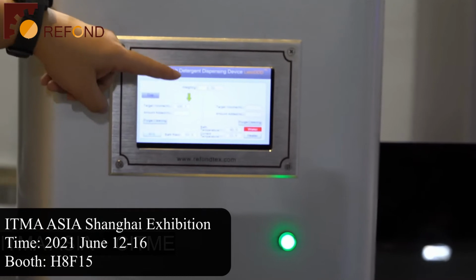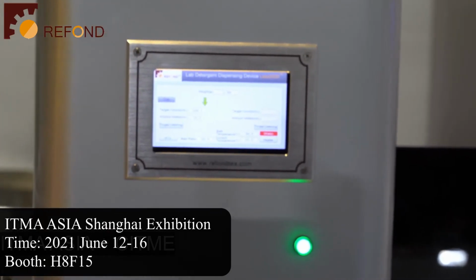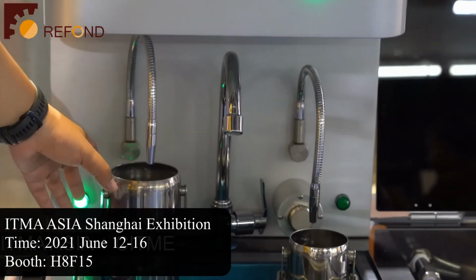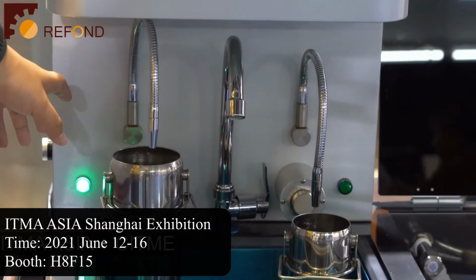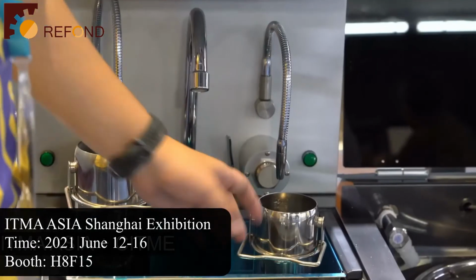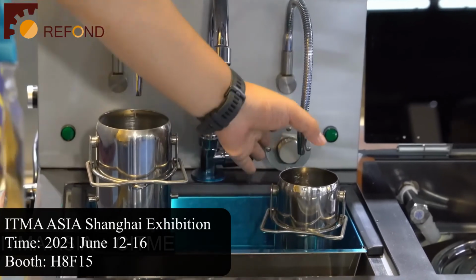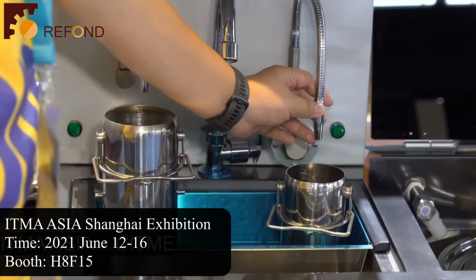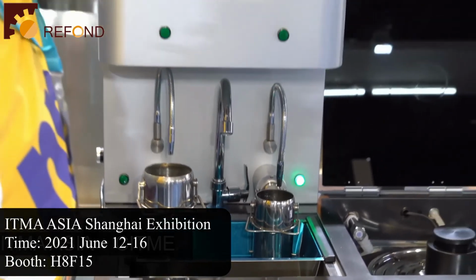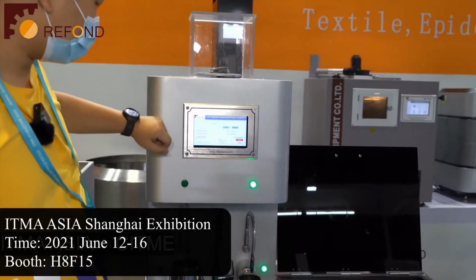It will automatically measure the weight of the sample and then pump the predetermined amount of detergent into the test container. The amount of water is calculated from the weight of the sample and the batch ratio. You can use two containers at the same time. So on the right side, there is also a position for the container. Put the container to the target position and then put a new specimen onto the balance.